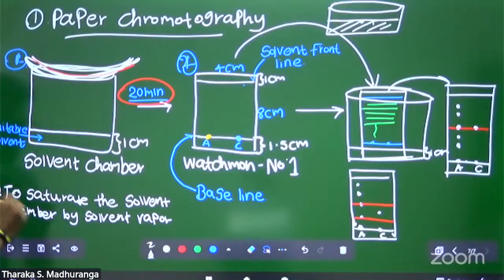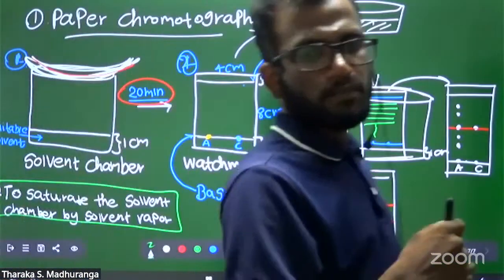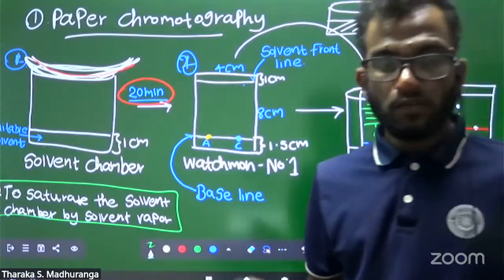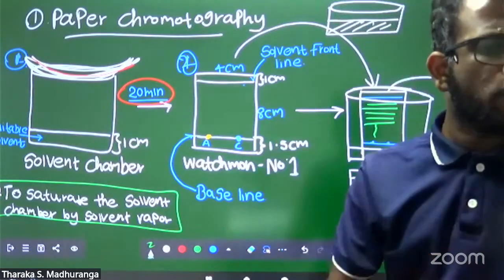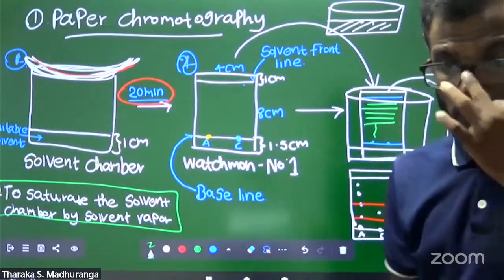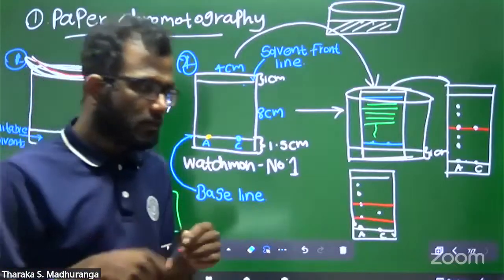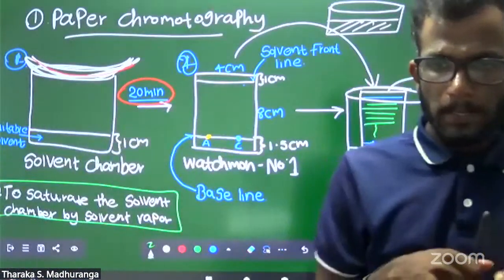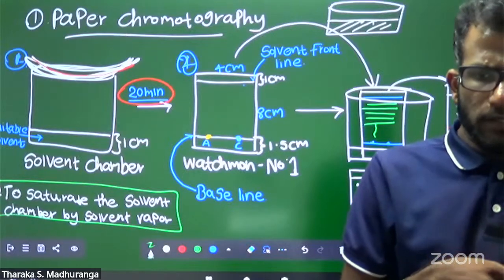That's the reason we need to close the solvent chamber and keep it for 20 minutes to saturate. What's the meaning of saturate?